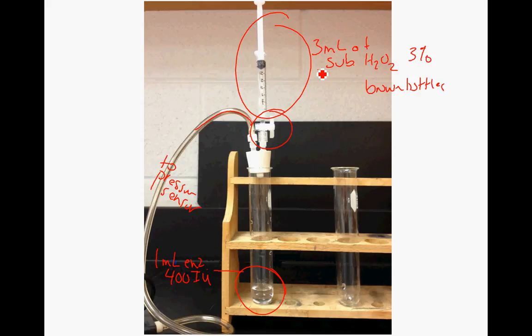If you're a group that's varying your enzyme concentration, then of course you're going to be using different enzyme concentrations down there. But here's something else that I tried to highlight with every group: what goes into here should be 1 milliliter of distilled water. Right? 1 milliliter of distilled water goes in there as well.